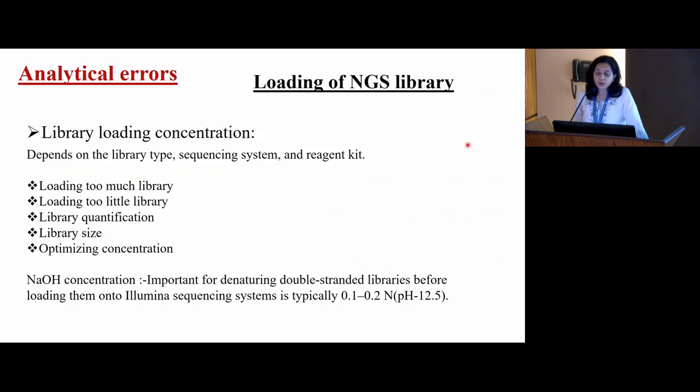Now, next is the loading of the NGS library. As I told you many times, we have to be careful at the time of pipetting and the storage of the reagents. But loading of the library depends upon the library type, the sequencing system and the reagent kits. Platform to platform, kits may vary, systems may vary, and according to that you have to define which kind of library you are going to add. Ultimately, if you load too much library or too little library, both are harmful. Library quantification is important; based on that you can reduce these errors.